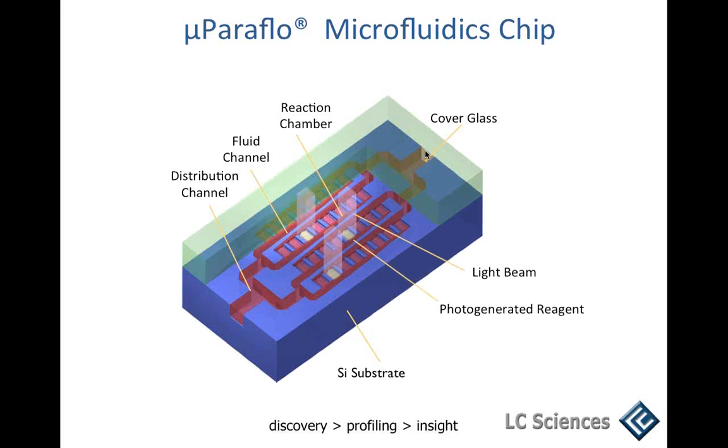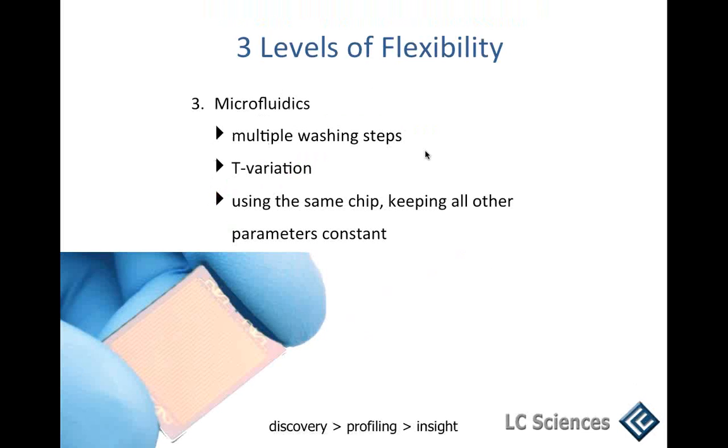Then the third part is the fact that we're using microfluidics. It allows us to run multiple washing steps or multiple binding steps at different protein concentrations. We can vary the temperature, and the nice thing is that we can change all these parameters while keeping the other parameters constant. So the data quality is rather good.